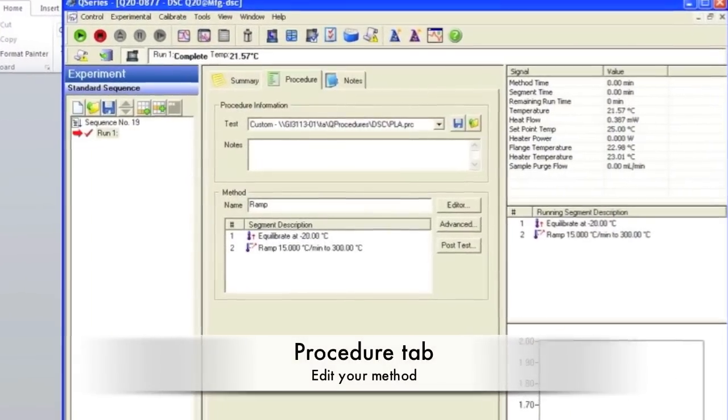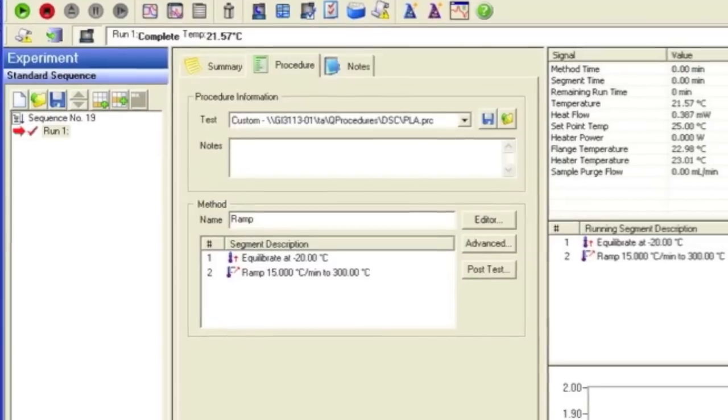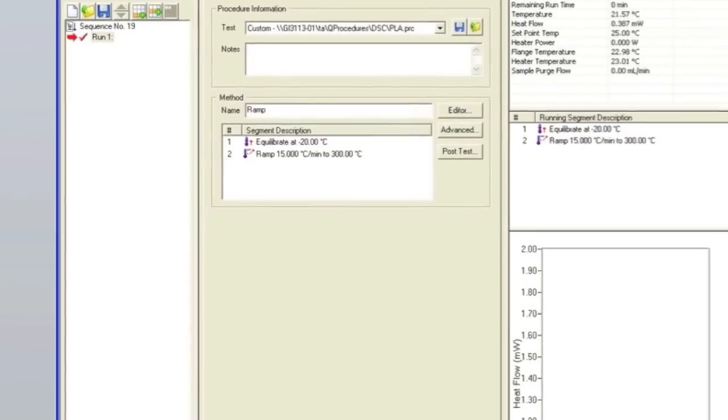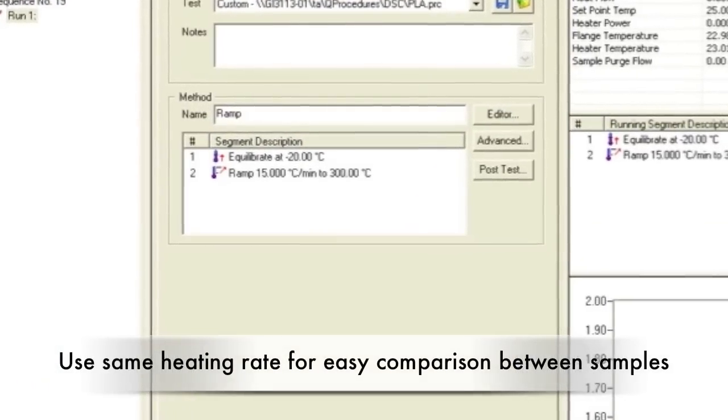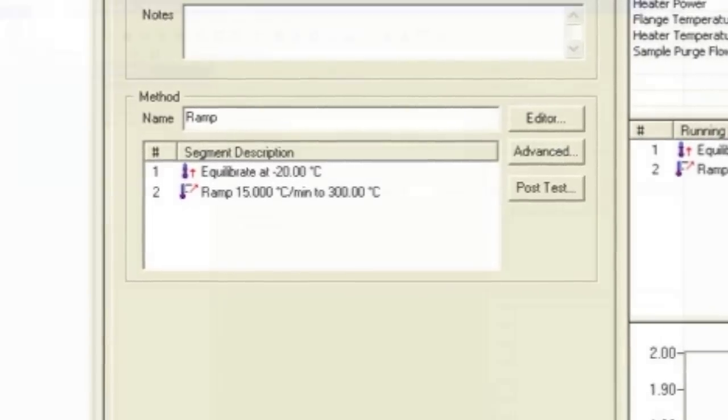In the Procedure tab, edit the method for your experiment. Most tests have an equilibrate step at room temperature, followed by a ramp to a certain temperature at a certain rate. The maximum temperature for the Q20 is 500 degrees Celsius. A variety of heating rates as high as 30 K per minute can be used. And isothermal steps can be added depending on the type of test.